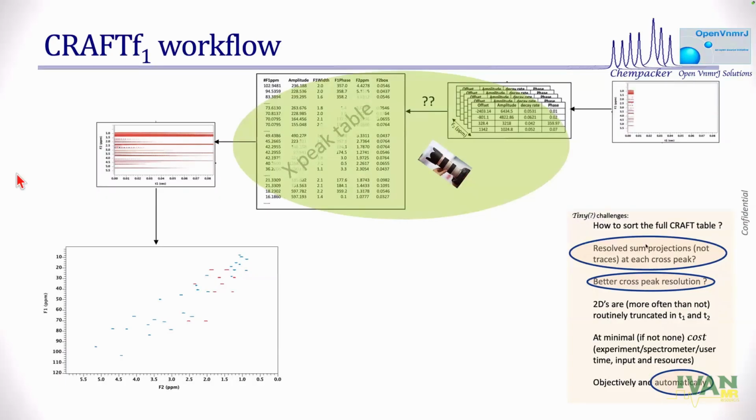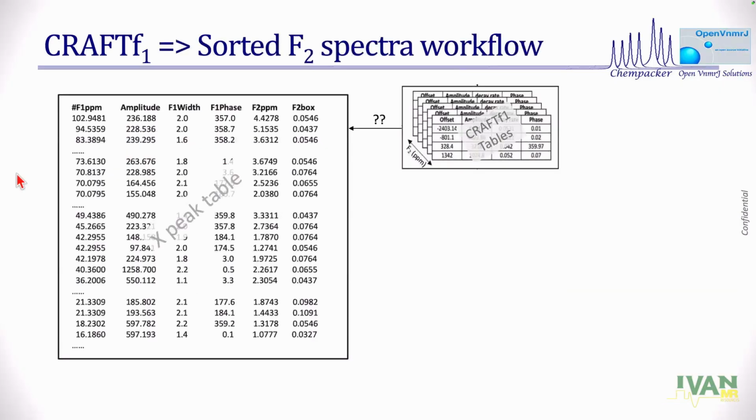And I want to get that. If I can get that, I got that, without giving up any cost. And we already challenged ourselves on the truncation artifact, truncation effect. That's a no effect, well, minimum effect, if you may. So let's zoom in onto that particular step. This is the most critical step in the entire workflow here.